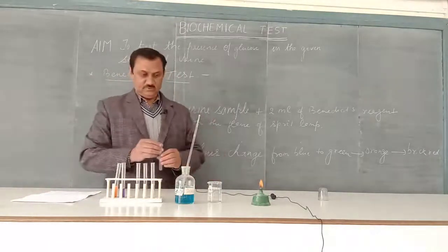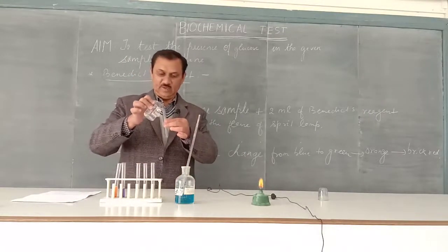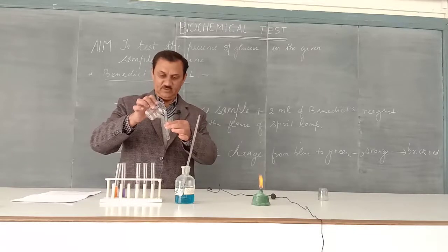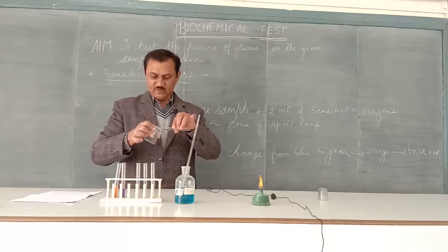Look at this experiment. First, we take 2 ml of the given urine sample in a test tube.